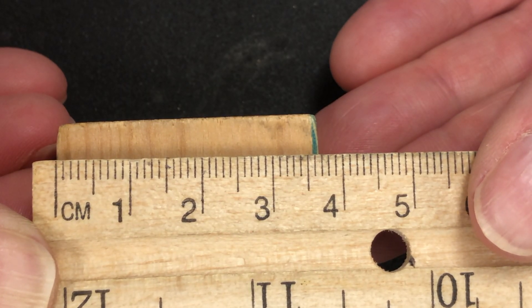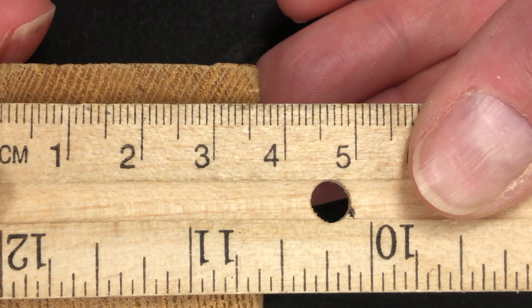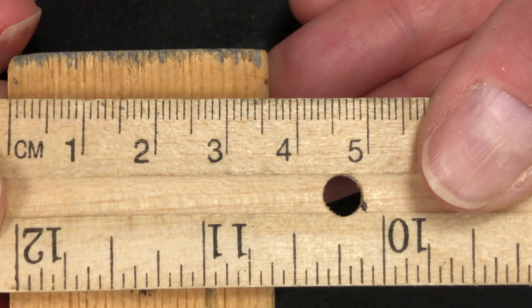Observe the meniscus of the water in the buret at eye level. Notice the meniscus is between seven and eight milliliters, so the correct measurement is seven point something. Record the measurement to the accuracy of the buret — that means estimate an extra digit beyond the smallest increment for proper sig figs.